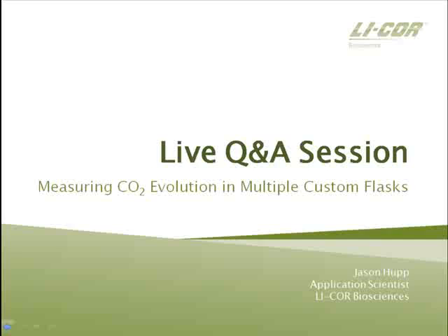Thanks, Jason. Our next participant asks, how small of rates can be measured with this system? Well, with a properly configured system, the limits to rates on the small end are really small. In tests that we've done here, we've been able to detect CO2 being evolved from a single fruit fly in a chamber. However, because these kinds of measurements require the use of very small chambers, there are a lot of subtleties to the measurement that aren't well covered in the application note or in this webinar. And so if you're interested in making these measurements, it would be best to contact one of our applications people first.